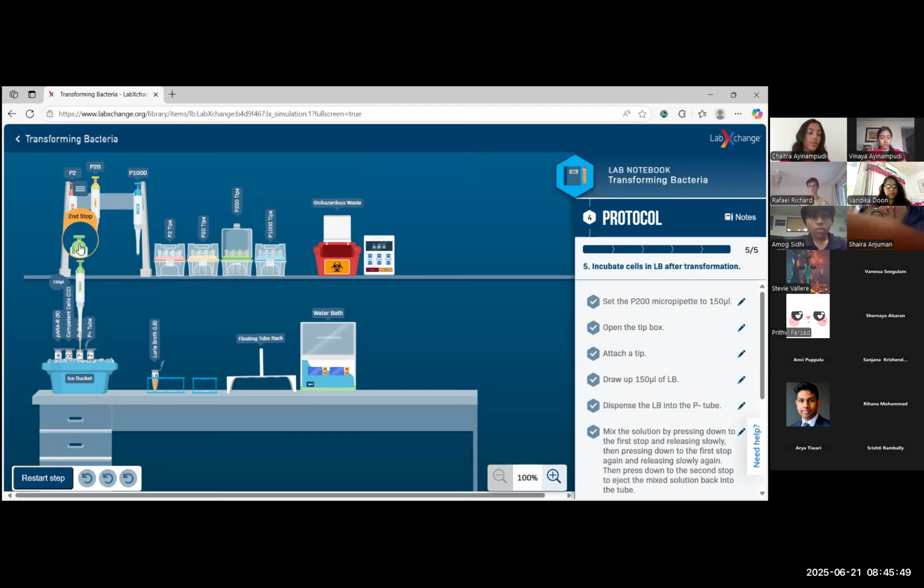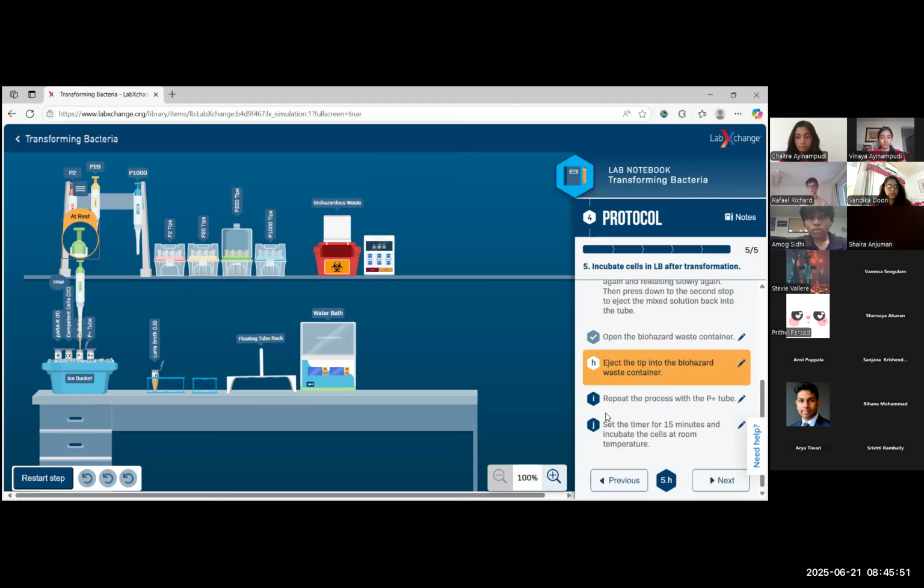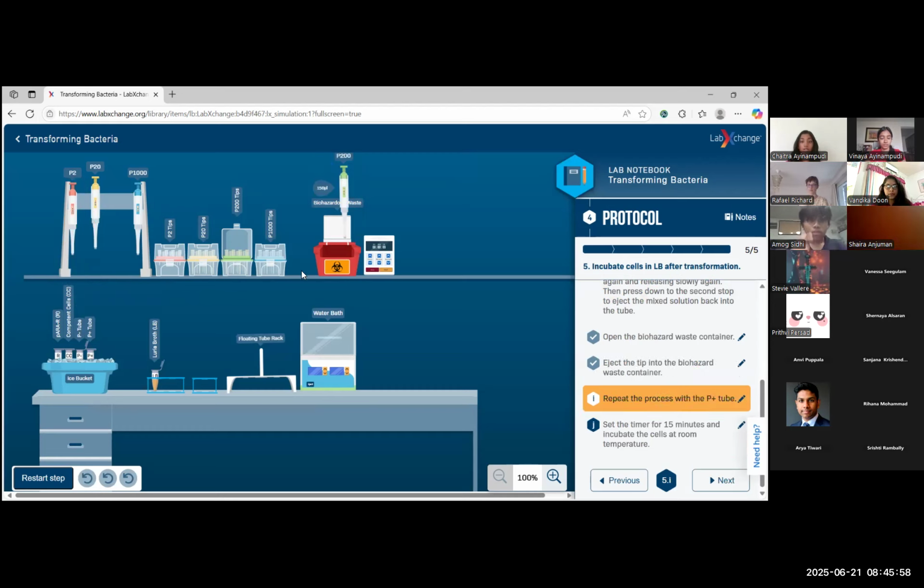We're going to the first stop, and second stop. And then we will eject the tip. Are we good so far? You doing good? So I'll let you guys get to the step.